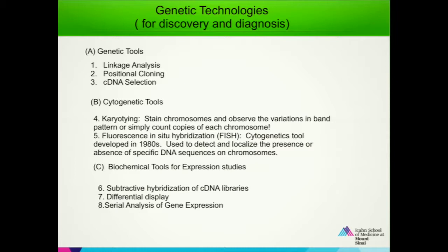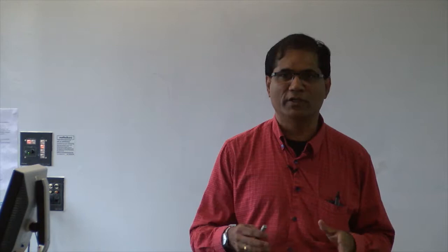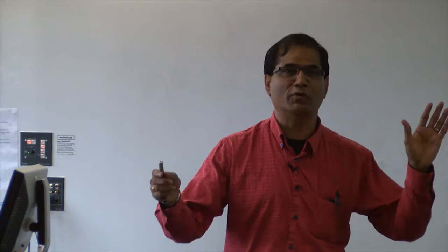And then we have cytogenetic tools that involve karyotyping and fluorescence in situ hybridization, FISH techniques, and then we have the biochemical tools. Examples are subtractive hybridization, differential display, and then SAGE. So all of you have heard about these techniques? Yes? In general? How many of you have heard all these techniques or know about these? Just want to know the background, right? Yeah, quite a few, but again, it looks like half and half.